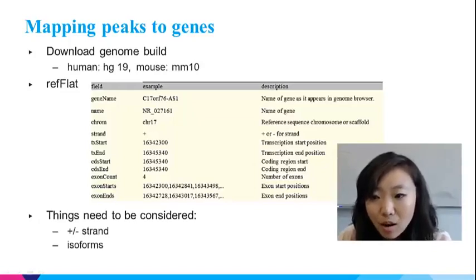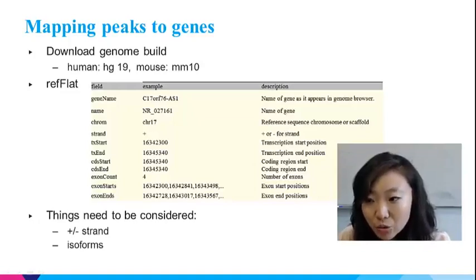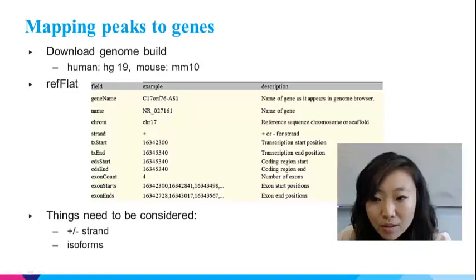For example, an R package called ChIPseeker is able to associate the peaks to nearby genes and also categorize peaks according to their nearby genomic features such as transcription start site, upstream of TSS, gene body, etc. In this and the next slides, I provide a general framework of how to do it yourself, mainly because the pre-made software limits the flexibility. You will have better manipulation of the dataset if you can play around with your own code.